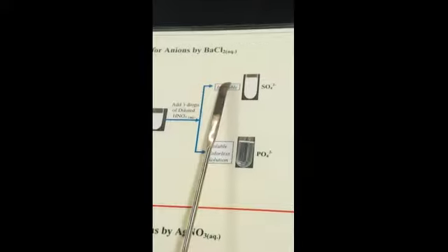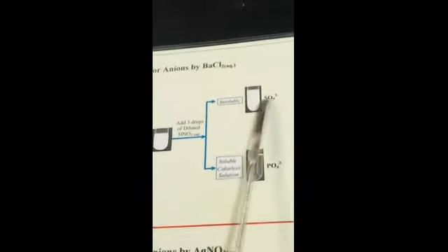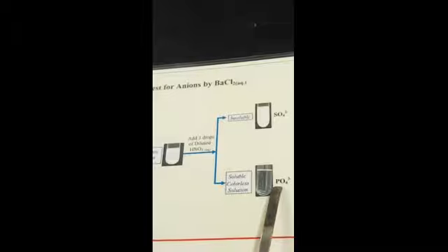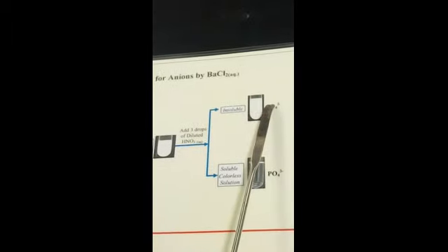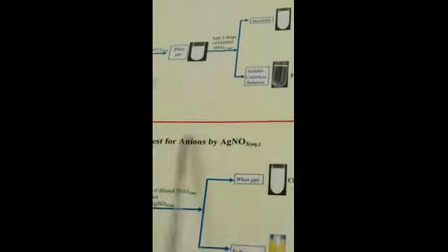So now go to the table again. You have two answers, one is insoluble, the other is soluble. Insoluble means you will have something remaining the same. So my answer is sulfate. What about the soluble one? No, I don't have it. I get the insoluble one, so this is my answer. Then if you want, you can also try the other test.